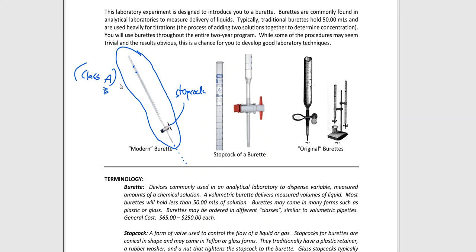All right, so here in the middle, it's just going to zoom in on the stopcock area, which is that valve that will open up and turn. I want you to take a look at this area right in here with the stopcock, and see how that is assembled. Whenever we clean and dry these, we normally take out the stopcocks and give those a good dousing as well. We leave these to the side, probably on a drying mat or a paper towel, because these are plastic and plastic things cannot go into the oven. No, no, no, I'm going to melt the plastic all over the place.